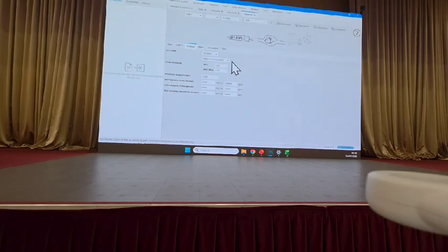Absolute intensity, on the other hand, will just set a noise level throughout the entire run, regardless if the noise is slightly different in one scan or another. Today, we will use absolute intensity, and we know with our instrument, we can set 1E5 for our MS1, and for our MS2, we can do 2E3.